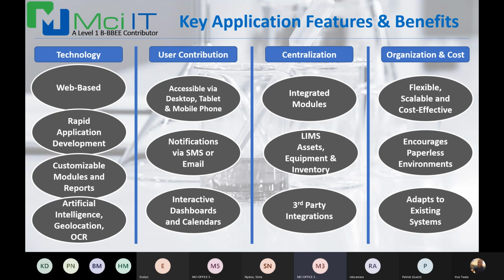Because our platform is highly flexible and configurable, it allows us to have a system that adapts to the customer's system as opposed to the customer having to adapt their quality procedures. So those are the key application features and benefits and themes, and I suppose that adds to the value proposition of the solution as well.